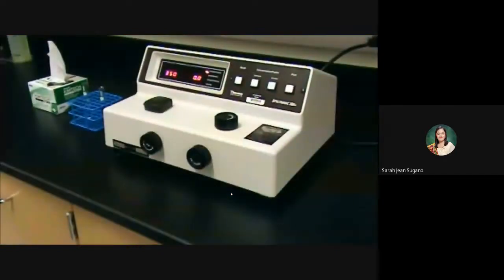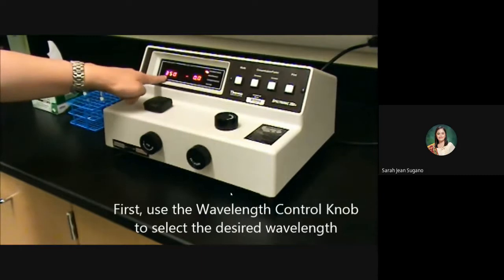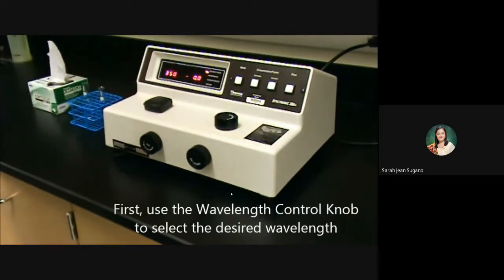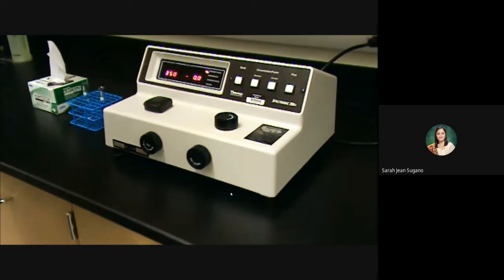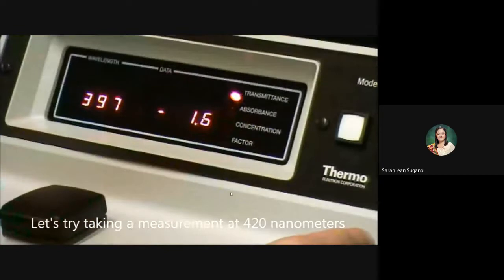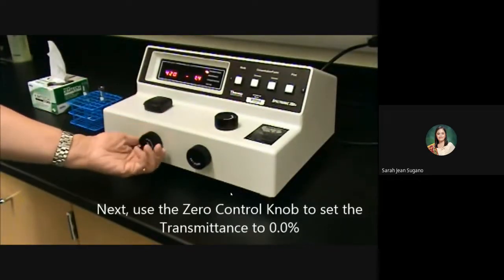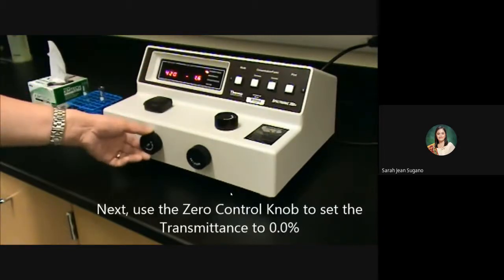In order to start taking a reading, you have to first set the machine up. So the first thing you must do is use the wavelength control knob and adjust the wavelength until the wavelength that you want to measure at is reached. And let's go ahead and try taking a measurement at 420 nanometers. Next thing you need to do is, using the 0 control, turn it until you get 0.0 showing up on the display.